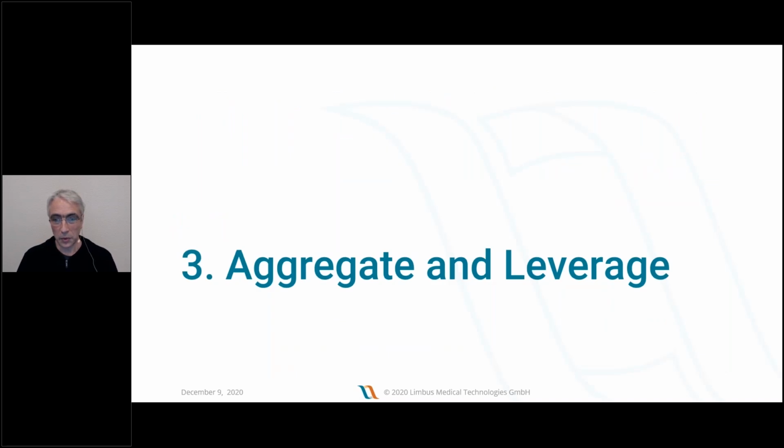The third principle that I would recommend you to follow is to aggregate your data and leverage the knowledge that you gain by aggregating data. A single data point is almost useless, but viewing many data points together can give you an enhanced insight.